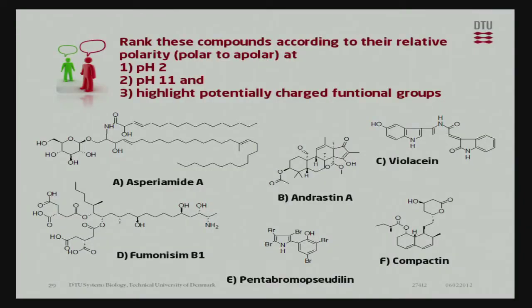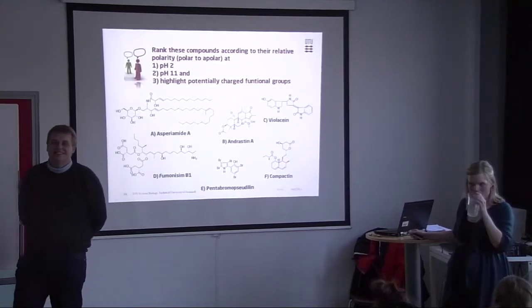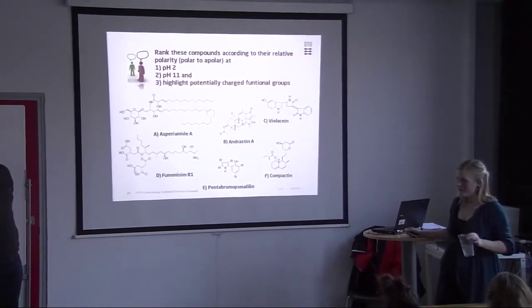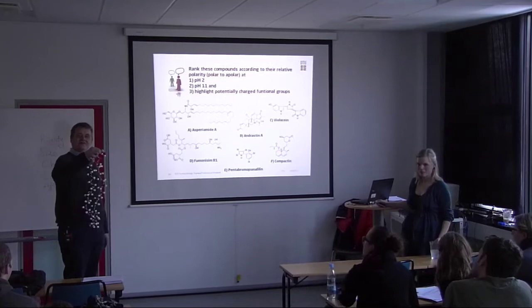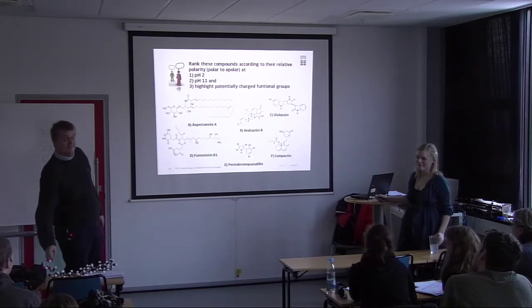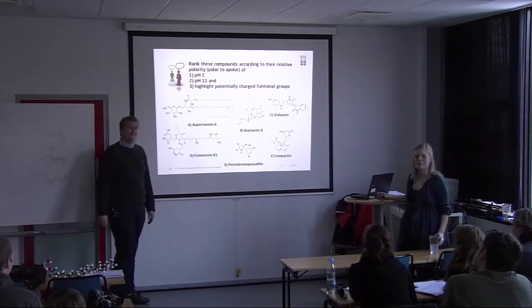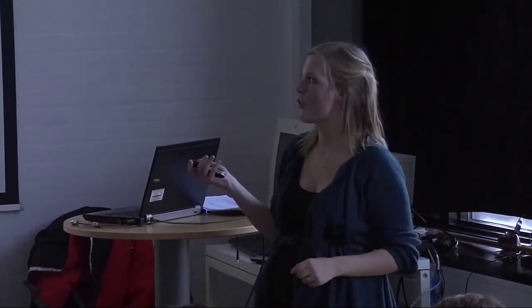And now we've got the remaining structures, and this is where it gets difficult. What do you think happens if we then remove a hydroxy group here? Will it come out before or after when it interacts with this? Yeah. So when you remove, that's where you got the little table there. So you exchange an OH with an H. Then you'll see a positive contribution to your log D value, which means that it will probably elute later. It will be more apolar.